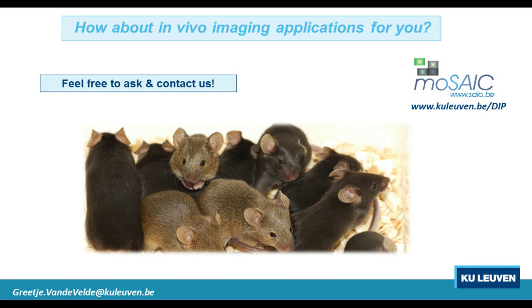What you can also do is to contact a vendor. For instance, you can contact Bruker and ask them if they know where colleagues in your neighborhood or your country have a machine, and put you in contact with colleagues. And in my experience, imaging people are always happy to share the machine for all the time that they're not using it. So I hope that that is somehow already useful to get you to have access to scanning equipment while you're applying for funding to get your own and have it close by for standard applications. Yeah. All right. How about this one?